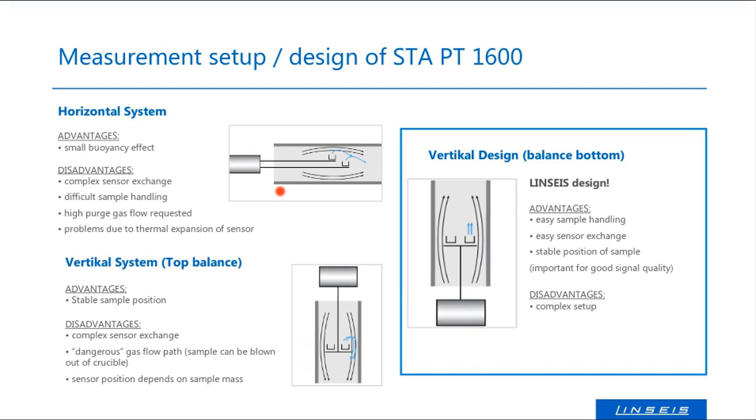In the past, or like 20 years ago, we did a horizontal system, and a lot of competitors as well did. In the meantime, technique has changed, and the vertical design is now the dominant design on the market. So 90% of the thermal balances you will find are vertical design. A lot of them are like this one, balance on the bottom, system on top. Some of them are hanging systems, and both systems are what is mainly used at the moment.